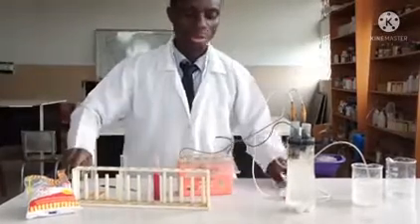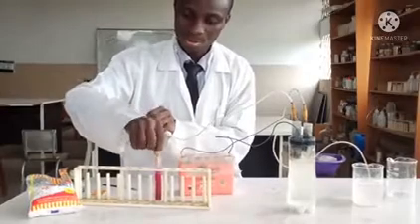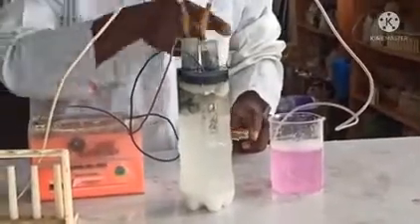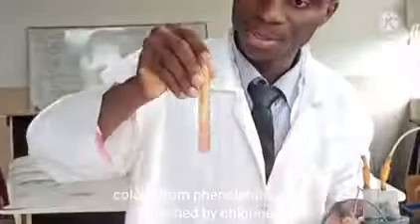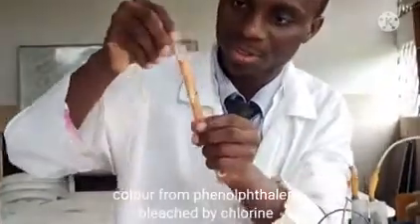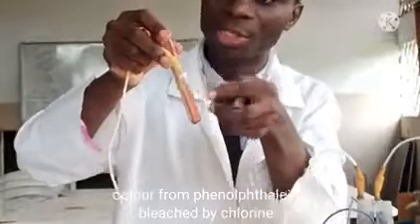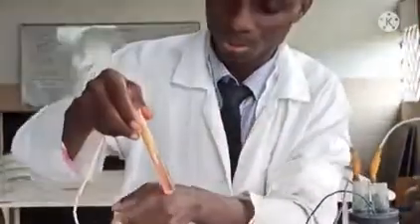I'm going to bubble chlorine into the sodium hydroxide solution — that's the reaction. The chlorine has almost bleached everything. So we have bleach here, because I bubbled chlorine into sodium hydroxide. I made a little bleach there.